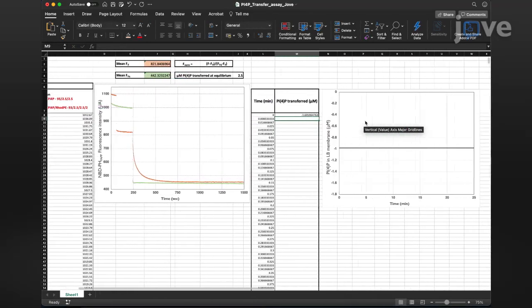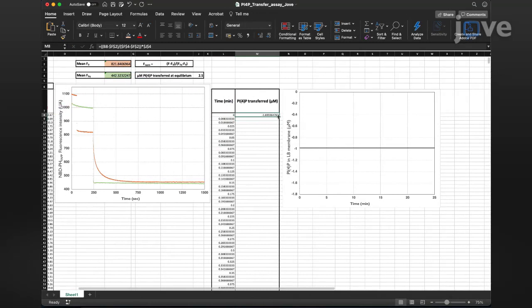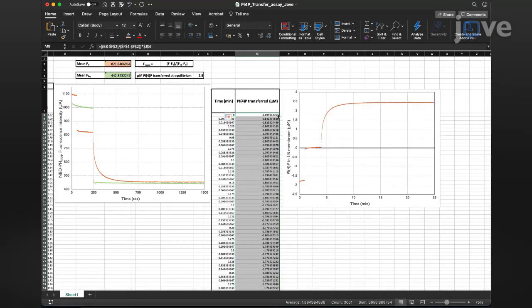Visual demonstration is critical to explain how to perform real-time measurements of lipid transfer by fluorescence. So demonstrating the procedure will also be Maud Magdeleine, an engineer from my laboratory.